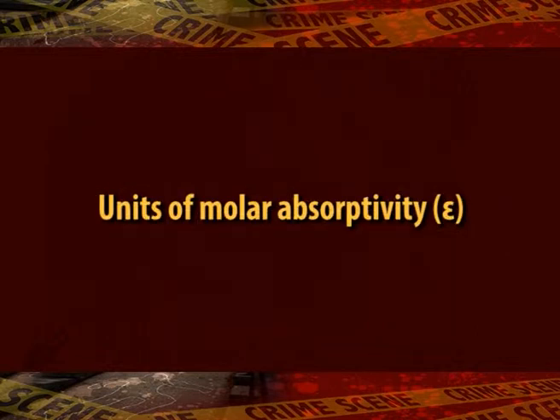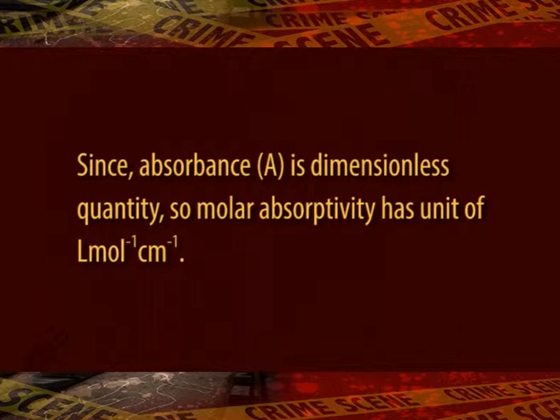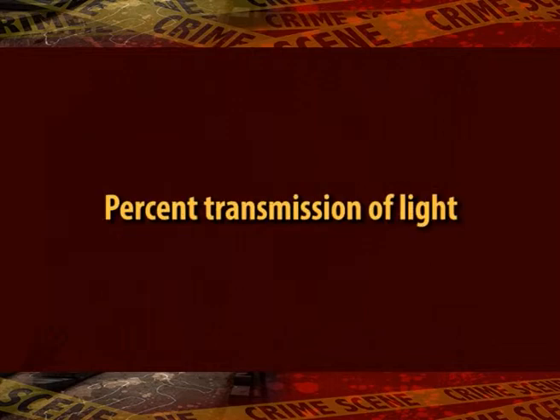Units of molar absorptivity epsilon. Since absorbance A is a dimensionless quantity, molar absorptivity has the units of liters per mole per centimeter. Percent transmission of light.